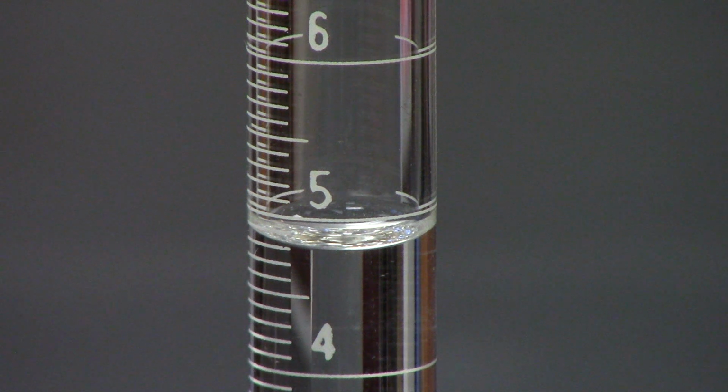And remember, you're allowed to have one more digit. And I'm going to call it, since it's almost exactly on 9, I'm going to say 4.90. Okay, so make sure you write down the 0. So it's not 4.9, it's 4.90. And you'll see that when we have the video on how to measure things.